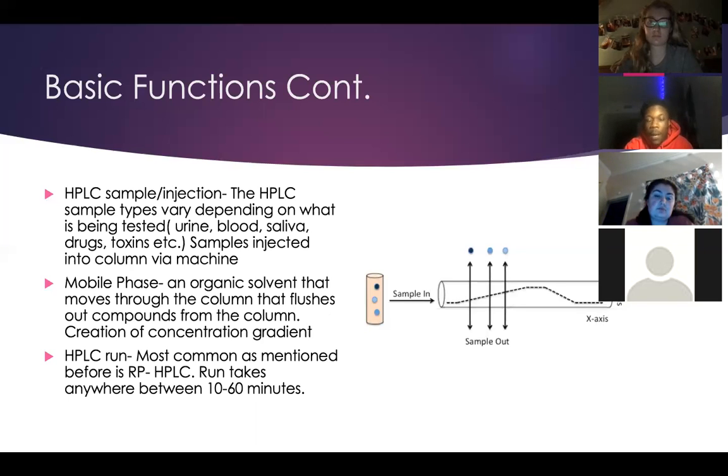And the compounds stick to either the column or the mobile phase, depending on the polarity. But eventually, all compounds will stick to the mobile phase when their polarity matches with the polar phase. And then they disassociate from the column, and they all exit the column at a particular time. This time is known as the retention time.